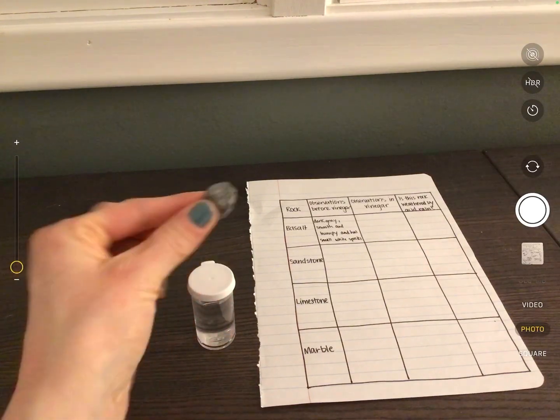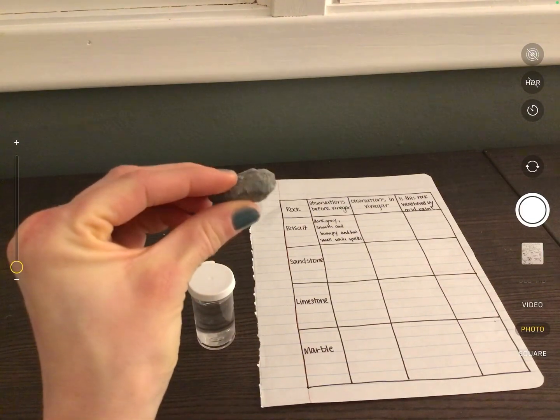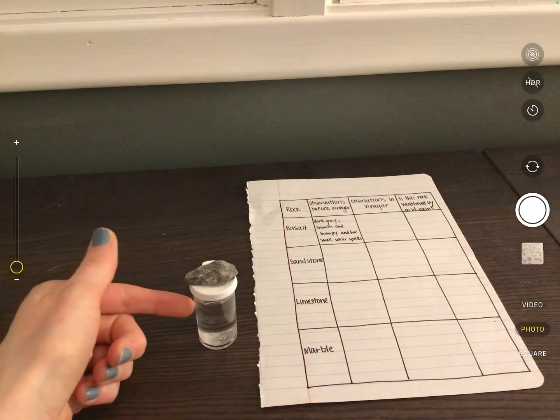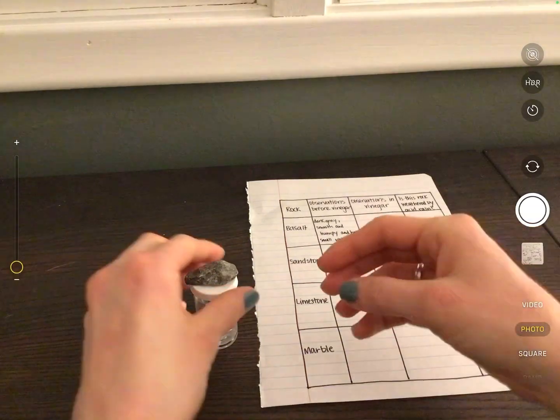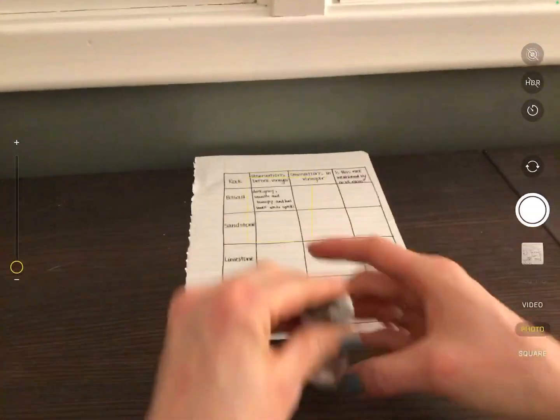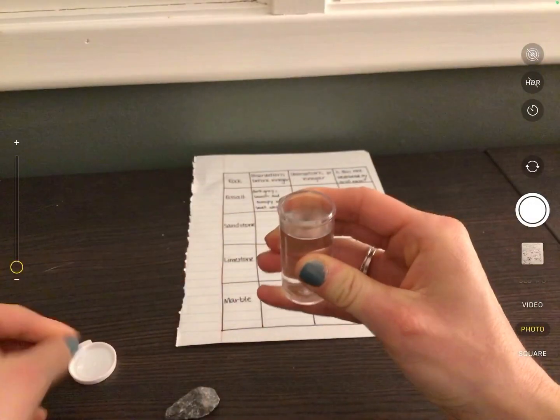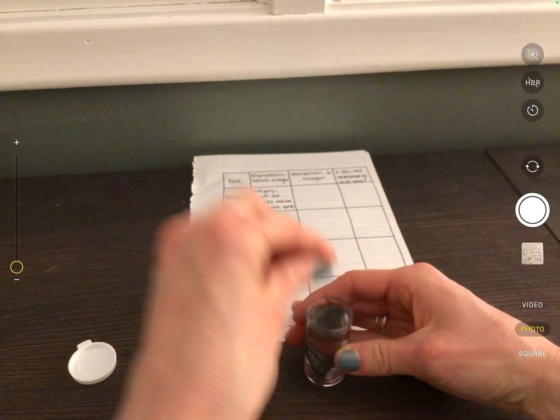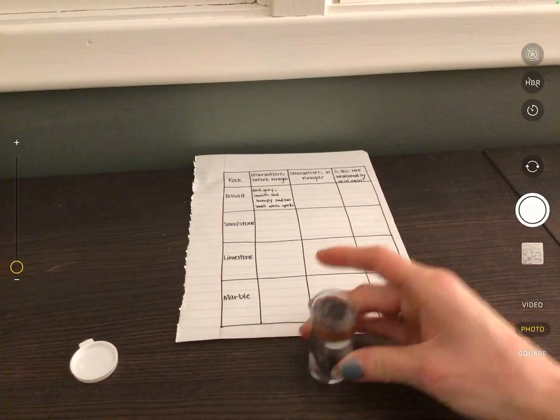If we place this rock sample into the vinegar and we see a lot of bubbles coming off of the rock, that means that there is a chemical reaction happening. Are we ready to try it? Here we go. I'm going to carefully take the cap off of my vial, and I'm going to drop the basalt into the vinegar. Now we'll give it just a second.